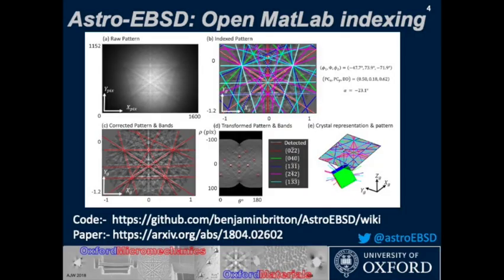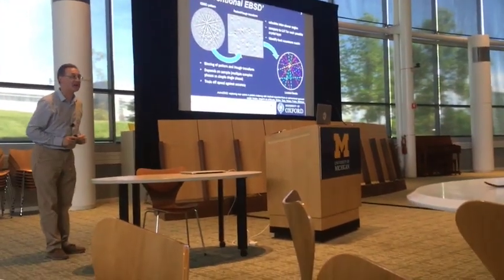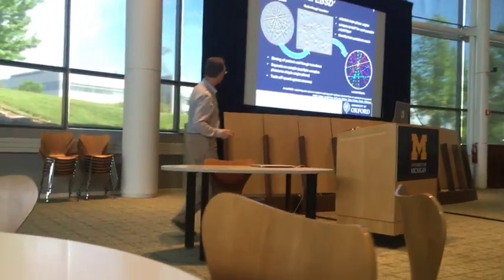I'll just re-advertise what I mentioned earlier on. There is now a MATLAB-based open source code available for you called AstroEBSD. If you go to GitHub, you can download it, have a play, contribute to it. There are bits and pieces in there that Ben Britton and his people at Imperial, and myself, have been involved in putting together. We know some bits of it are not particularly good, so pick it up, make it better, put the better version on GitHub so that we can all benefit from that.